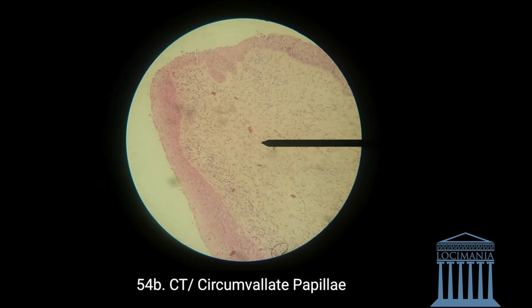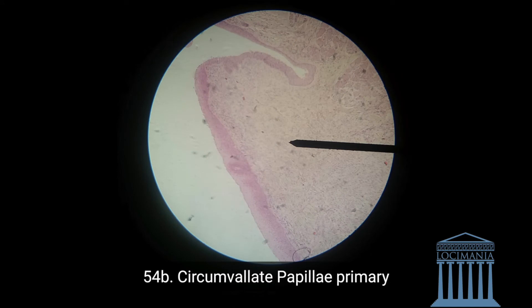This is the primary circumvallate papillae — I'm going to speak about the secondary circumvallate papillae soon. All of that structure is called circumvallate papillae. The full strawberry is called circumvallate papillae. Here we have the primary circumvallate papillae, and now we're going to have the secondary papillae by invagination.